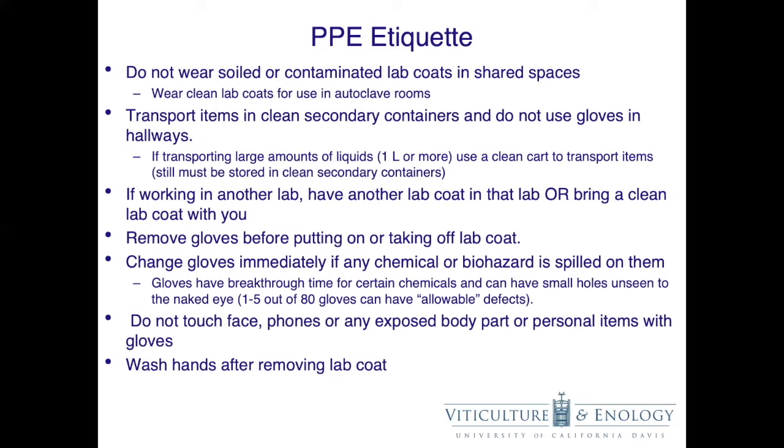Remove gloves before putting on or taking off your lab coats. I have seen people touch biohazardous materials or chemicals with gloves, remember that they need a lab coat, and then put the lab coat on with those same gloves. Doing this contaminates the inside of your lab coat and therefore any part of you touching the lab coat.